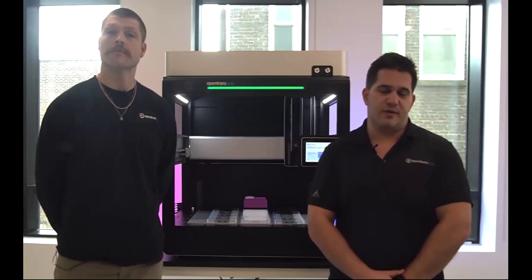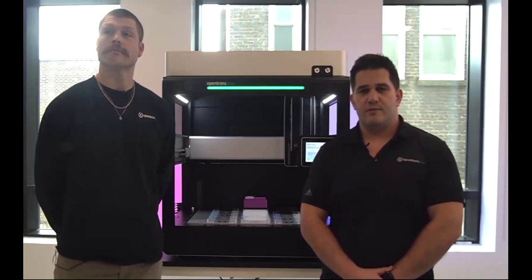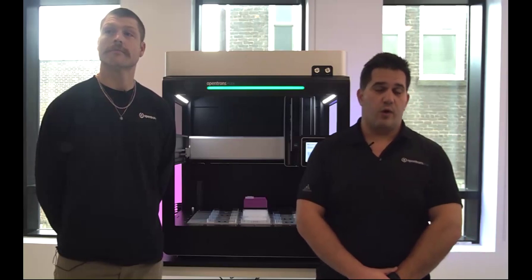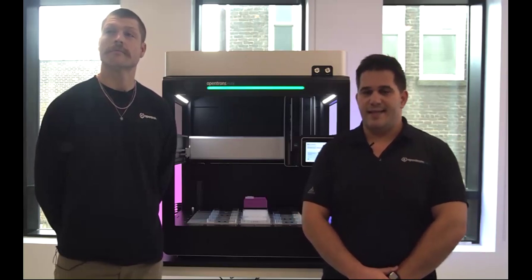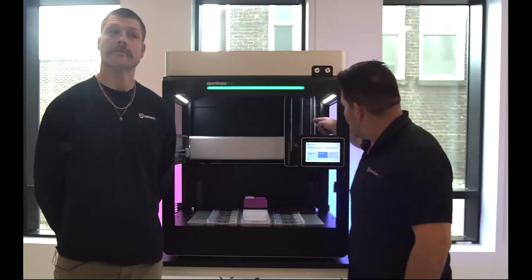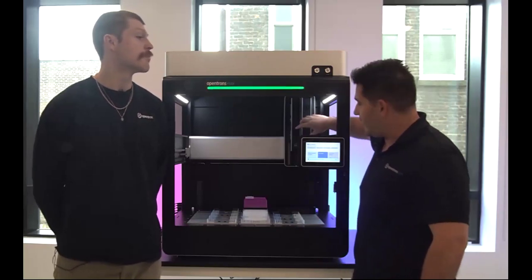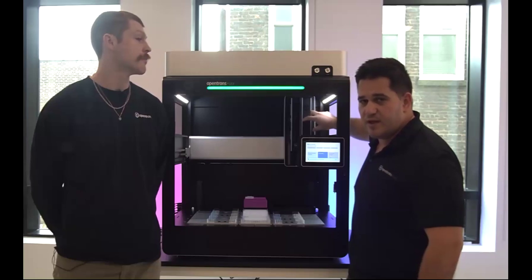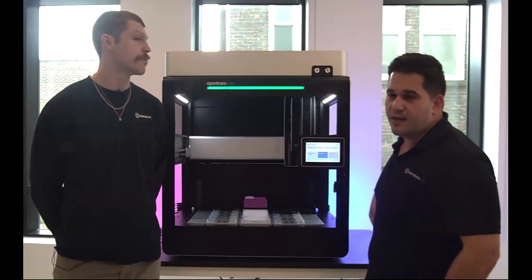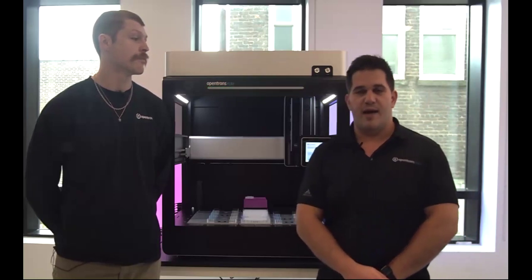I mentioned earlier, but just to reiterate, the pipette configurations you can have on the gantry are 2 singles, 2 multis, 1 single, 1 multi. If you want, you can just have 1 single or 1 multi, and 1 96 channel only, because of the size of the pipette. You can't see the 96 channel here, but you can see there's a multi-channel and a single channel. The 96 channel pipette is the width of both of these, maybe even a little bit bigger. And because of that, it takes up the entirety of the pipette slots on the z-axis of the gantry. So what that means is that you can't put any other pipettes on if you have the 96 channel.